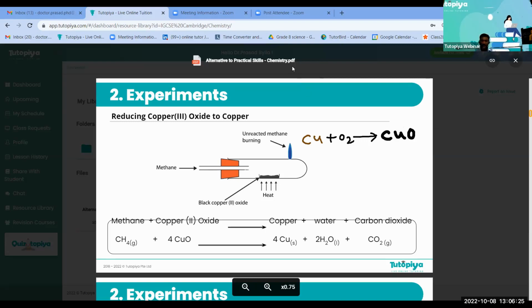That's why, when there is a short circuit, the electrical equipment and the wiring turn black because of the fire. The copper wire gets heated up in the air and turns to black copper oxide. Now I want you to take that copper oxide, put it in a glass tube, close it with a one-hole cork, and insert an open tube. It's a glass tube open at both the ends. Insert it. Now heat this copper oxide from outside.